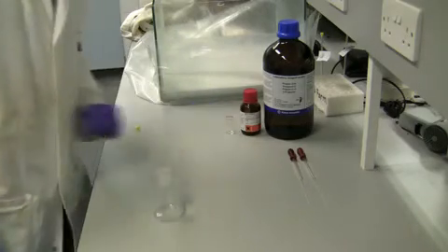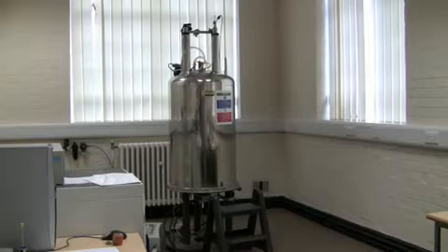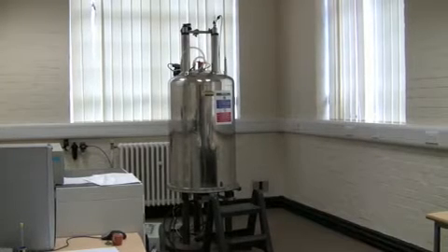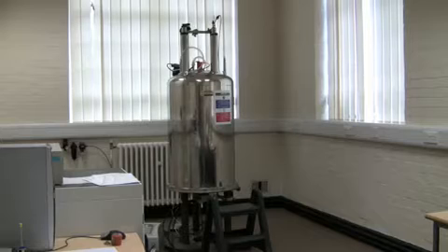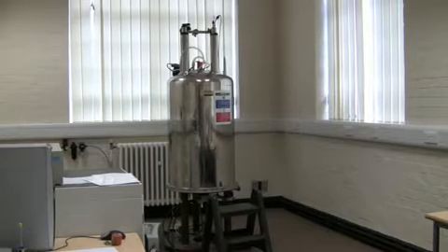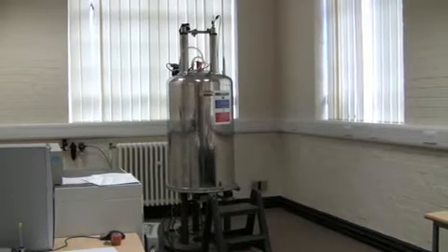The sample is then taken to the NMR spectrometer for analysis. This is the main part of the NMR spectrometer. It consists of a supercooled magnet surrounding a coil in which the sample sits. This coil is connected to a radio wave generator and detector.